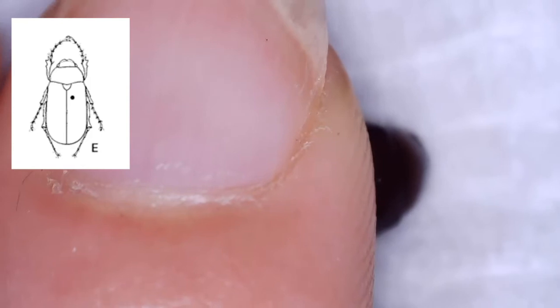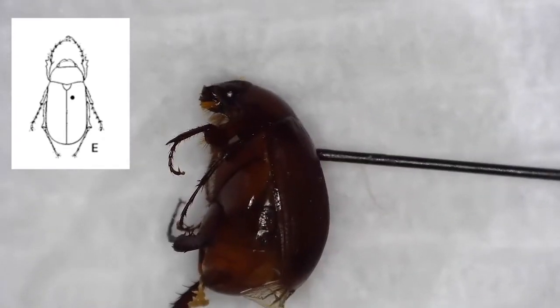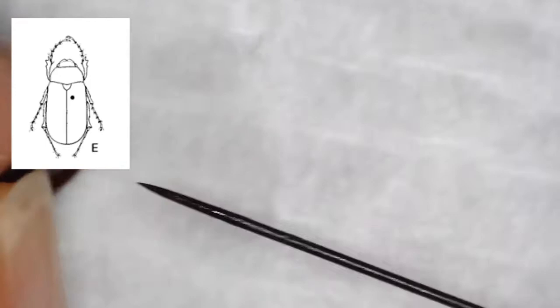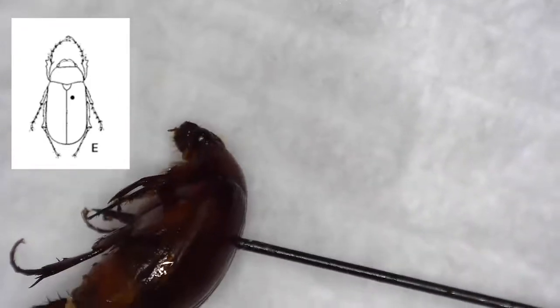Now, because this is a beetle, you want to pin it in the right elytra, slightly right of the center line that divides the two elytra. As always, you want to make sure that your insect is pinned at a 90 degree angle, which my first shot did not have. So I'm going to try to pin that again and get it more perpendicular.